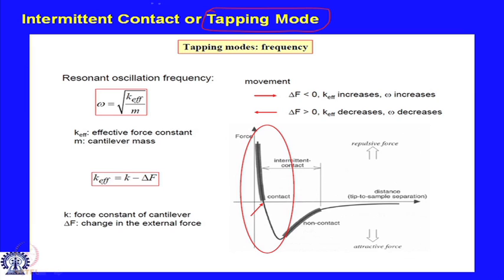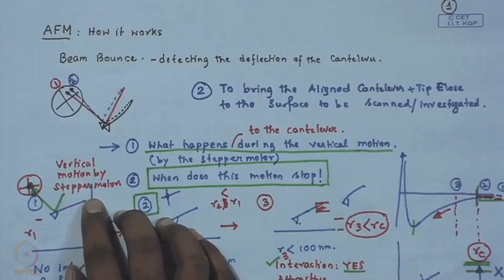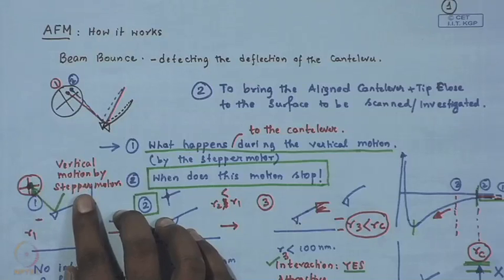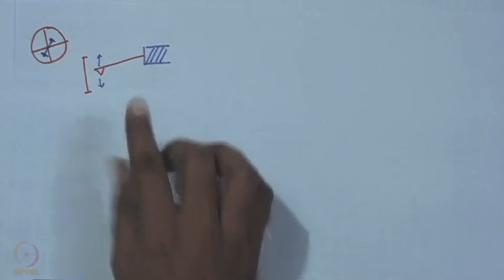So, you are somewhere over here, closer than a non-contact mode operation, but a little further away from contact mode operation, which is purely in the repulsive regime. And what happens is your approach now is with a cantilever which is not only aligned. Unlike a contact mode approach where your approach started with a cantilever which was purely aligned, here your approach starts off with a cantilever that is first aligned and then an amplitude is given to it.